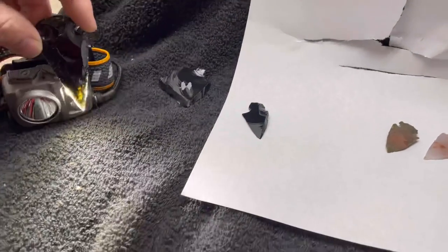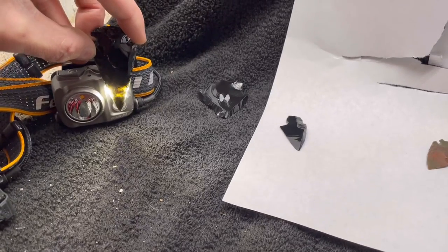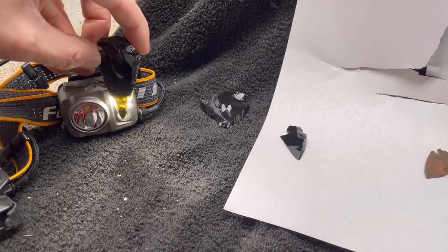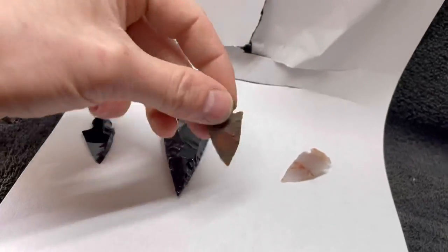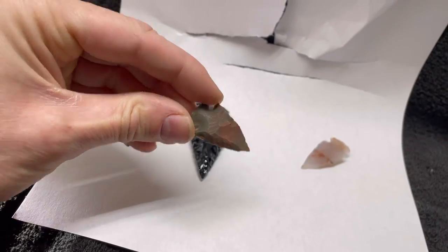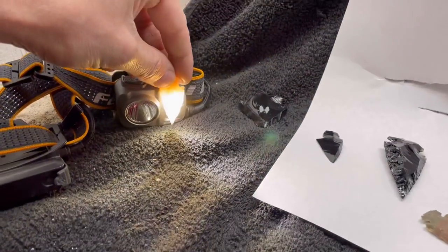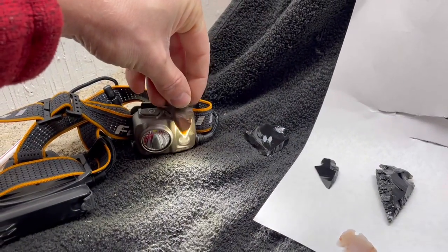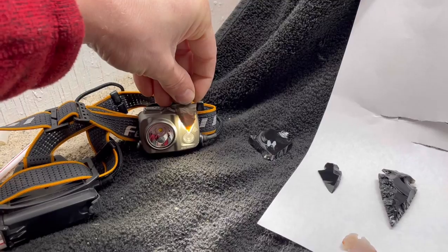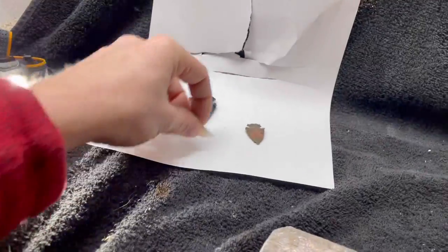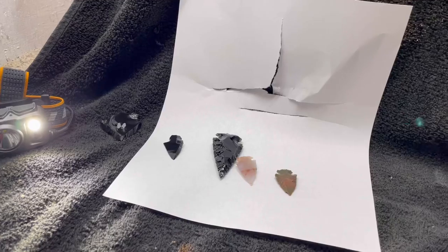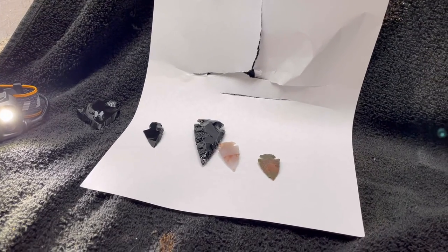This is a green obsidian which lets a lot more light through as you can see. This one is made out of flint and this one is made out of agate. You see the agate lets a lot of light through and the flint not very much. Maybe a little on the edge there when it's thin. So let me set up and we'll see what happens when we put them in acid.